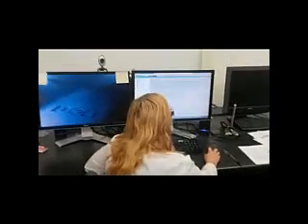Then you go over to the HPLC, and this one's already running. The only thing you're going to do different than I think you guys did last semester is you're going to go into easy sequence, load the caffeine D sequence, and I'm going to change it for you right here so that it says 3, and it's going to load them here. From here, you're going to change the name of everything.